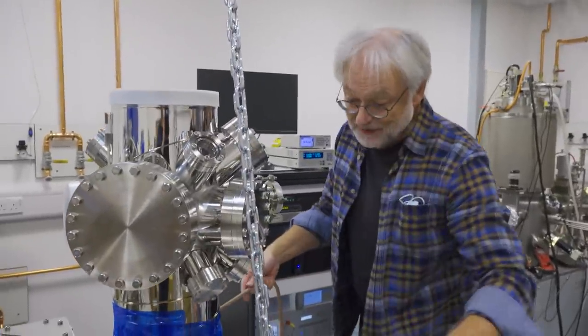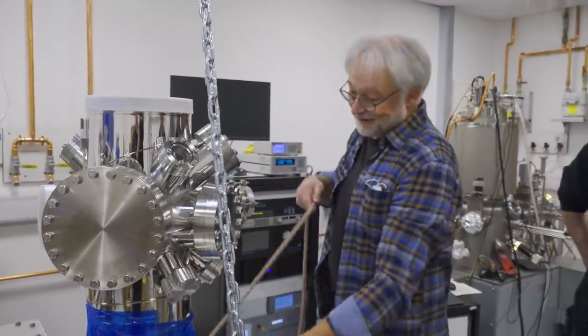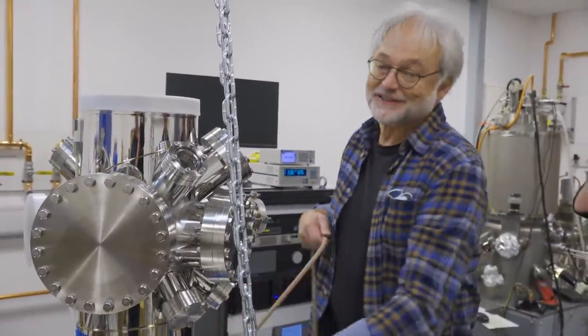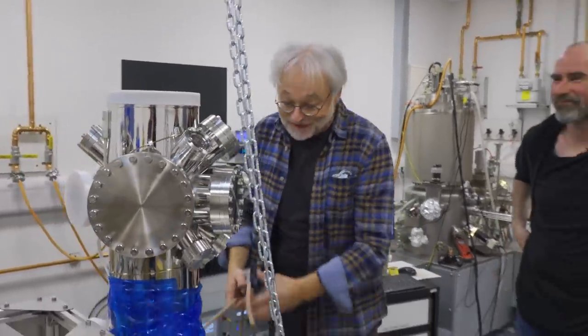The hard stuff in the beginning normally goes pretty quick, and then there will be days where the tiny things are going to be happening, like assembling the STM to the cryostat and the wiring and everything, and then you do one wire per hour or something and nobody will see what you're doing.